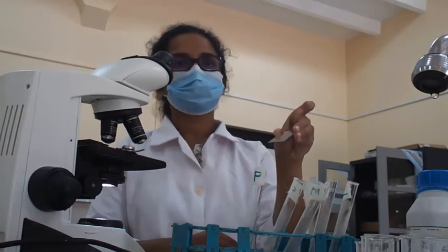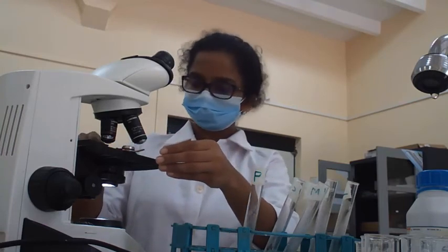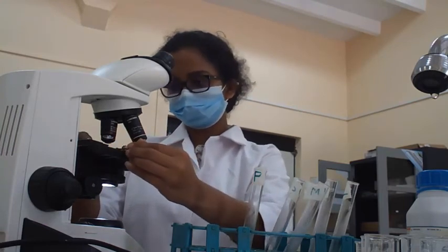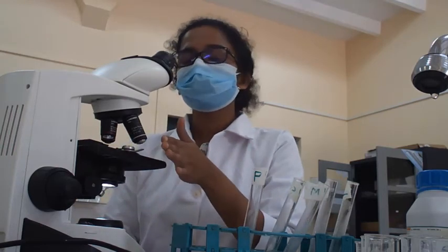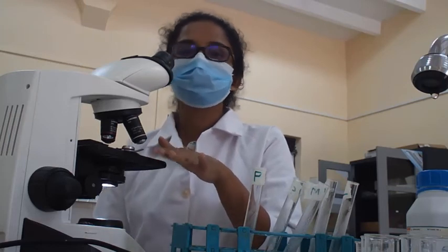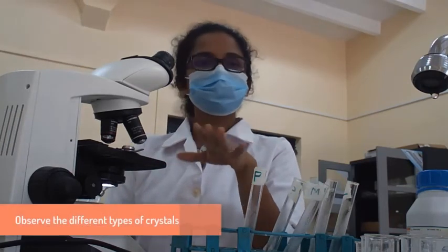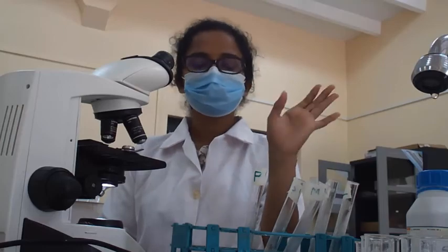After that we are going to place the slide on the microscope, and we have to focus it, and through the microscope we are going to observe different structures or different crystals formed by different sugar solutions.